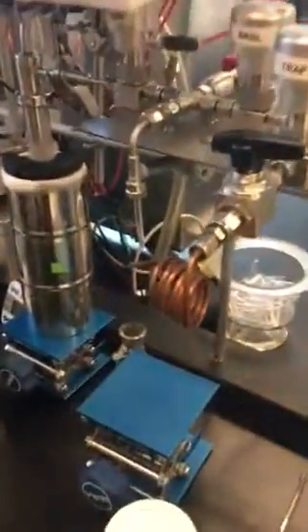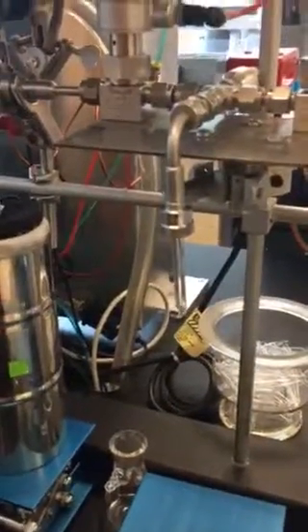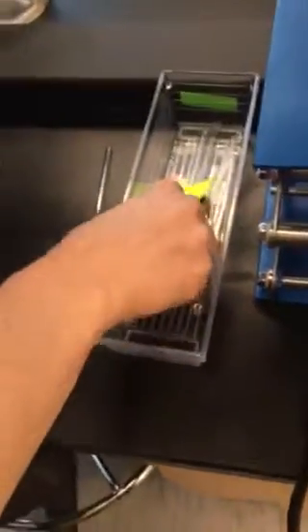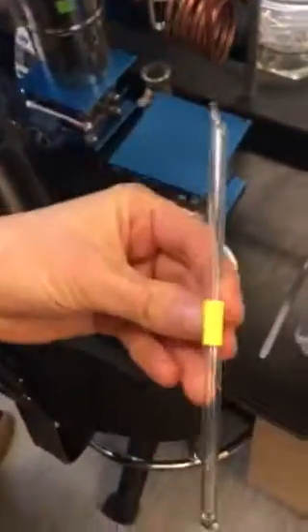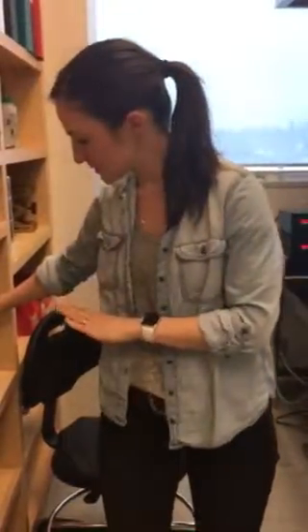If you watch the other video that I sent, I'm not gonna do a flame sealing right now just because I don't have time. But if you watch the other video, then you can see me flame sealing a whole bunch of samples. And then in the end, we have these nice little break seals. So you can see the glass has just been melted up at the top. So at this stage, you have clean CO2 trapped into a break seal, and they can sit like this indefinitely.